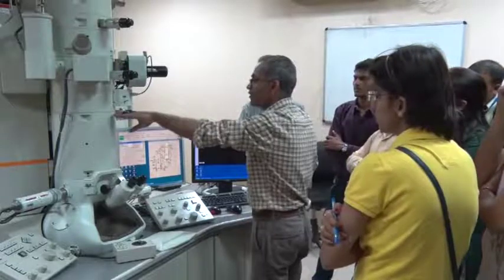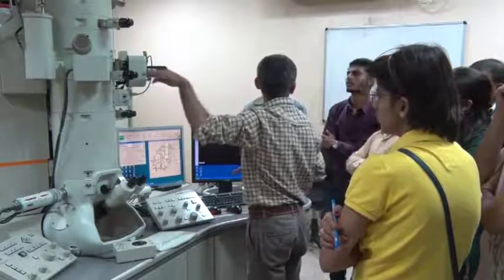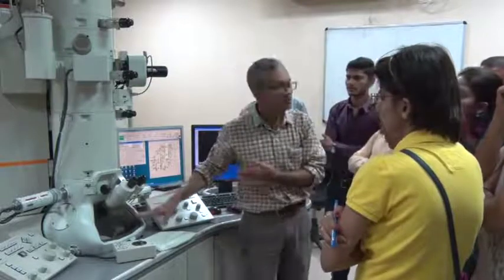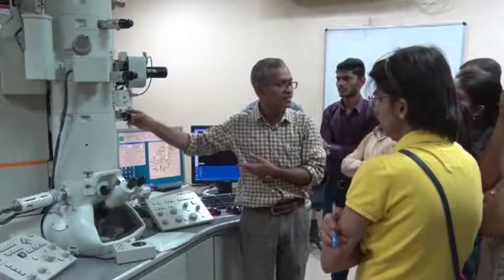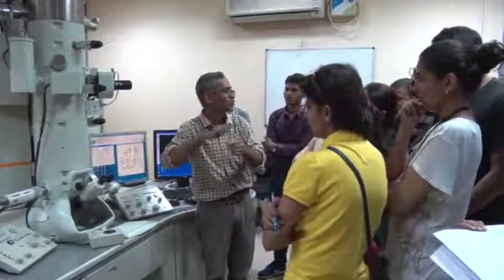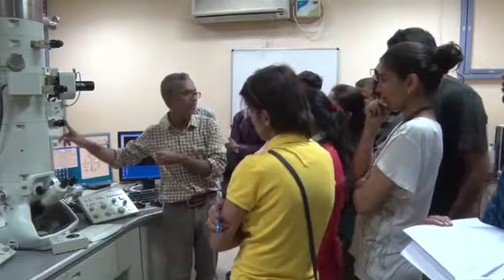Now the shadow of that aperture will fall on the sample because they are conjugate, they are equivalent planes. When I look at the screen in the imaging mode, and if I have inserted the selected area aperture, I can see the aperture also. I can see that it is selecting a particular area of the image or particular area of the sample. So that's why the name is selected area aperture.